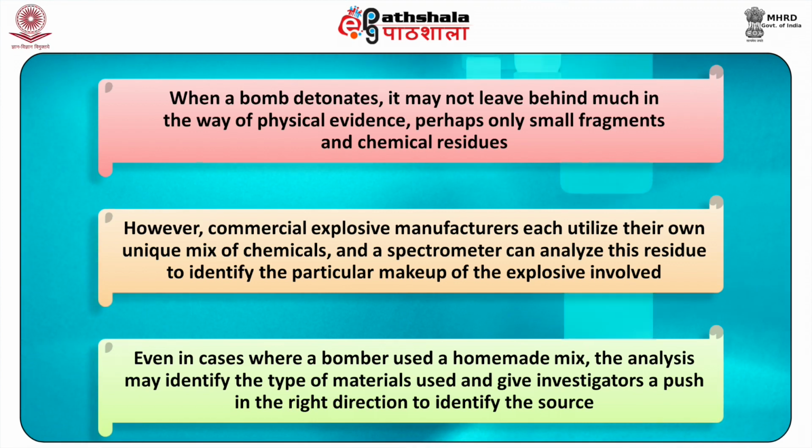However, commercial explosive manufacturers each utilize their own unique mix of chemicals, and a spectrometer can analyze this residue to identify the particular makeup of the explosive involved. Even in cases where a bomber used a homemade mix, the analysis may identify the type of material used and give investigators a push in the right direction to identify the source.